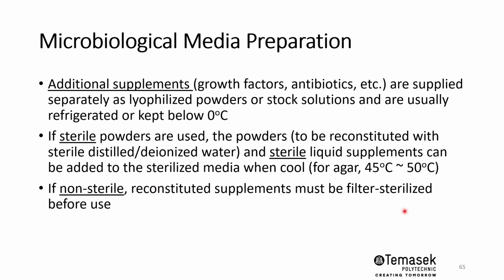Often these media are in large volumes, so it doesn't make sense to sterilize the whole large volume of media itself. So those reconstituted non-sterile supplements can be filter sterilized, typically through a membrane filtration before use.